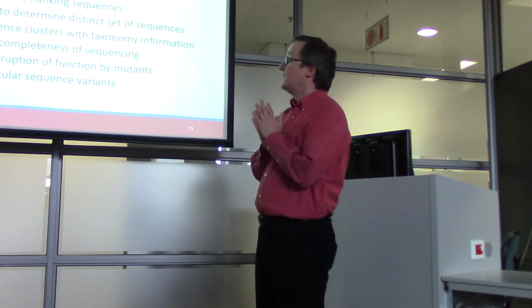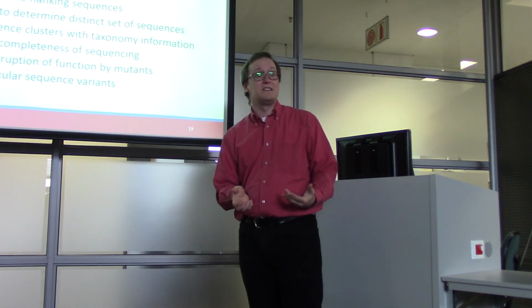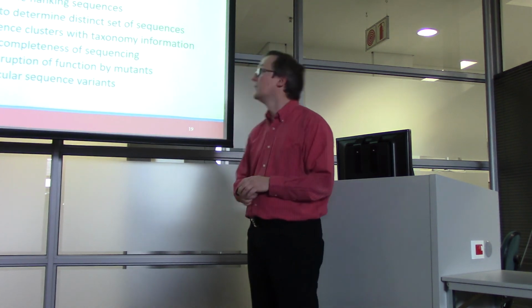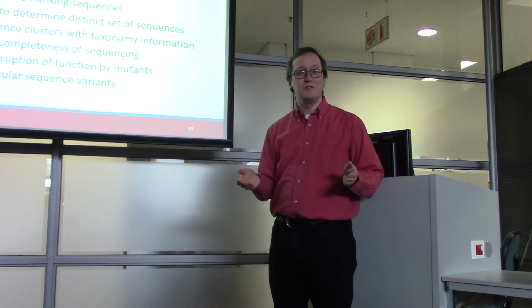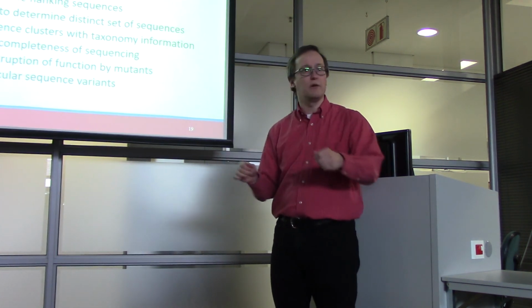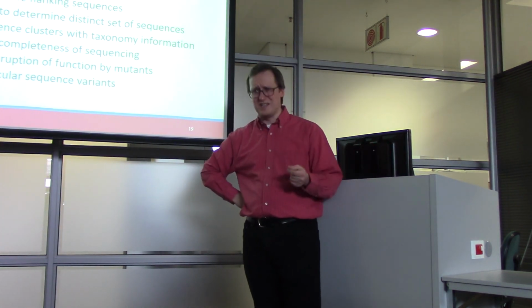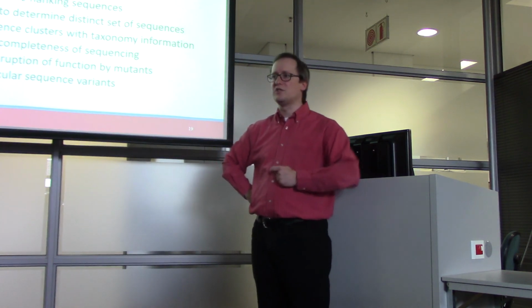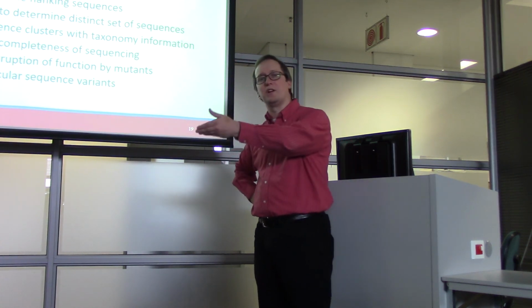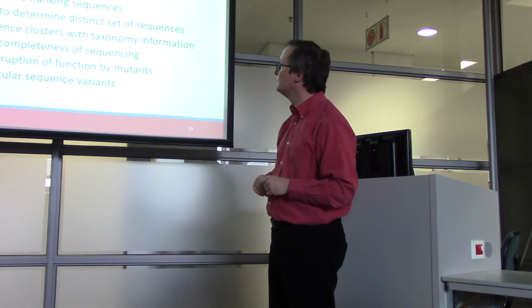All right, lots of takeaway messages, but I was really pleasantly surprised to see just how much bioinformatic thought has gone into supporting Amplicon sequencing. We start with selecting PCR primers, some very long-lived tools there in that space that have seen a lot of tinkering over time to improve their functionality. Controlling the quality of sequencing is always necessary when we're dealing with NGS. So using a tool like FastQC, I didn't mention it, but one called Trimmomatic that uses these quality scores to figure out how to lop off the ends of reads is available too.